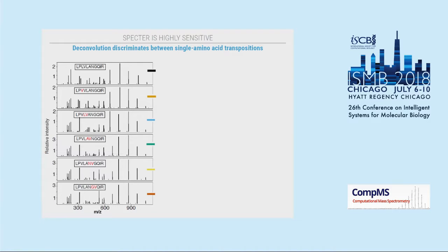And this is a scenario that's been very difficult to deal with in DIA so far because the data is already so complex due to this co-isolation of multiple precursors. Looking for that level of specificity has just been too refined a problem to examine in DIA so far. So to test Spectre's ability to do this, we actually synthesized families of peptides with highly similar sequences.